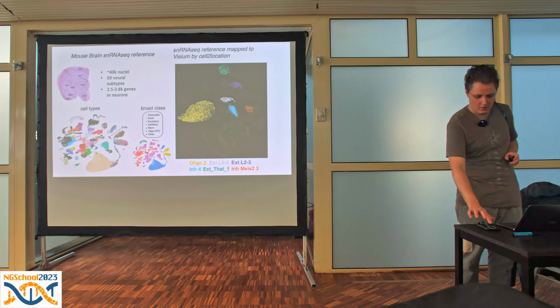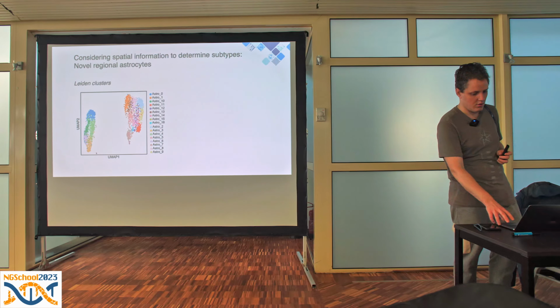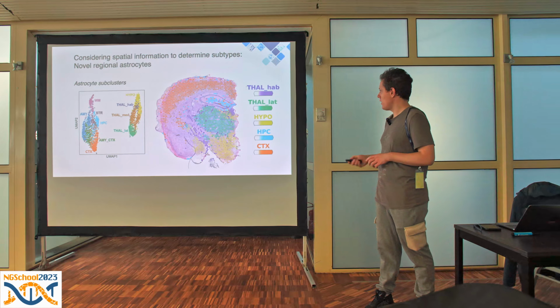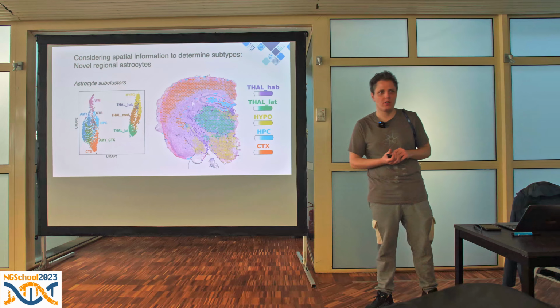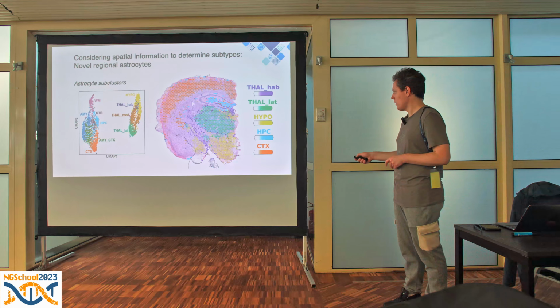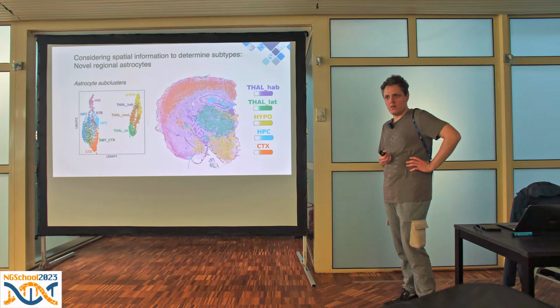In the next slide, did you actually find any differences in the expression between the thalamic astrocytes that were spread throughout the brain, essentially, the dark blue cluster that seems to be scattered all around? Habenular astrocytes have much higher abundances in the correct area called habenula. They are somewhat scattered around here, and this could be mistakes in mapping, because we also did validation using single molecule FISH that Victor will probably talk about later today, and we see that these astrocytes are indeed present in that area.